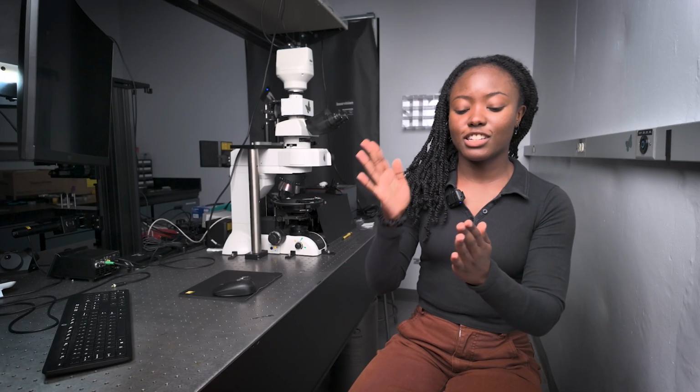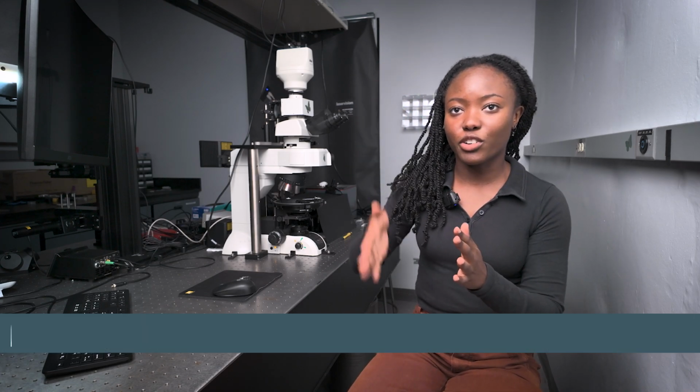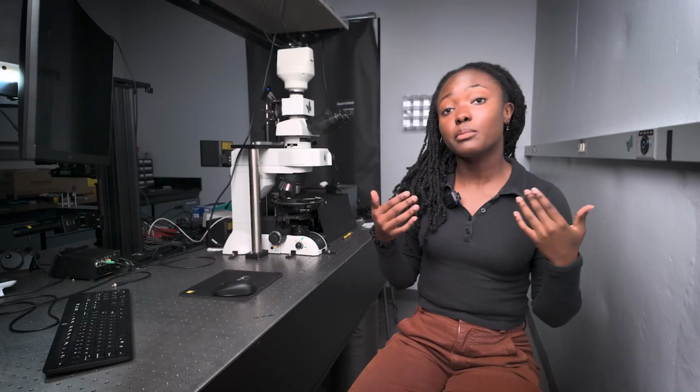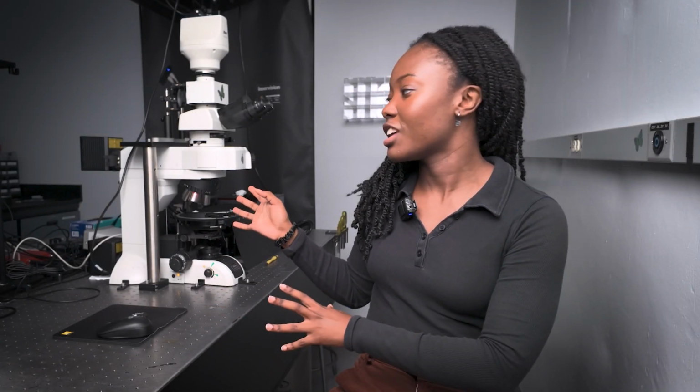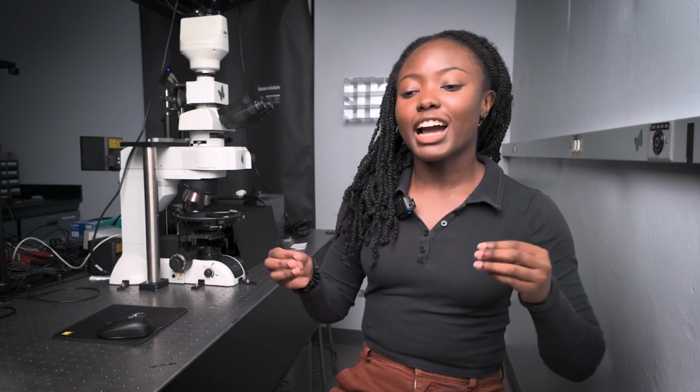The morpho has these super long gratings along their scales that have a specific direction that will respond to polarized light. Polarized light is special because it propagates in a specific direction. There are certain materials that are sensitive to these polarizations of light and will respond to it selectively. It causes a super high reflection when you image with our super special polarized light microscope. Very high sensitivity of reflections at certain angles.